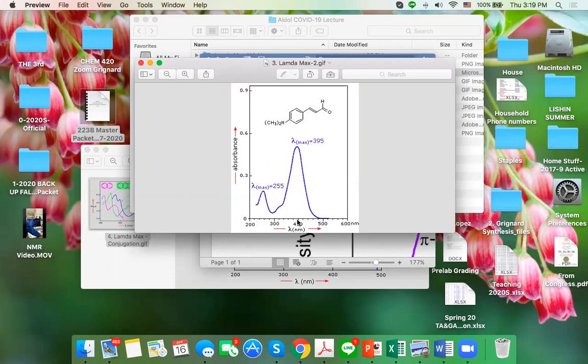So the x-axis, you see the wavelength, and then in the y-axis, you see the absorbance. It means, wow, this molecule is capable of absorbing around, about 380, 395. It will give you a peak. Oh, okay, so that means at 395 nanometer, this molecule will remove the harmful effect to some extent. Am I right? Yeah, it will block the photons from coming into your eyes. Yes, okay. So this is the application for it, okay? And I'll talk about that next time. Okay, it has a little bit of theory, so I want to save it until next time, okay?